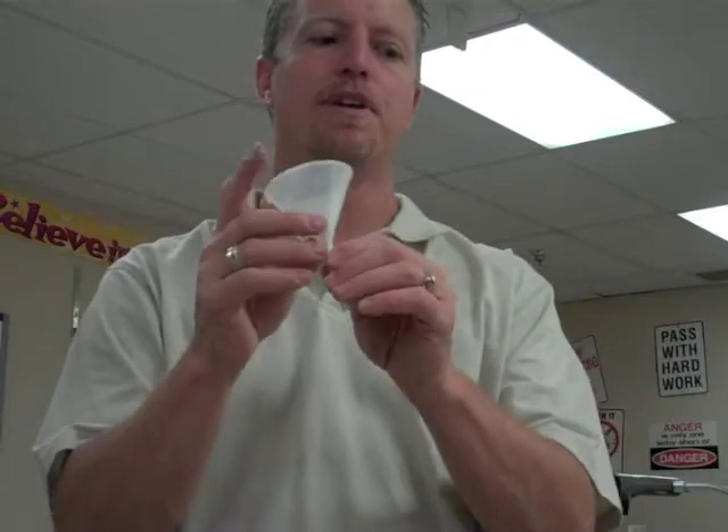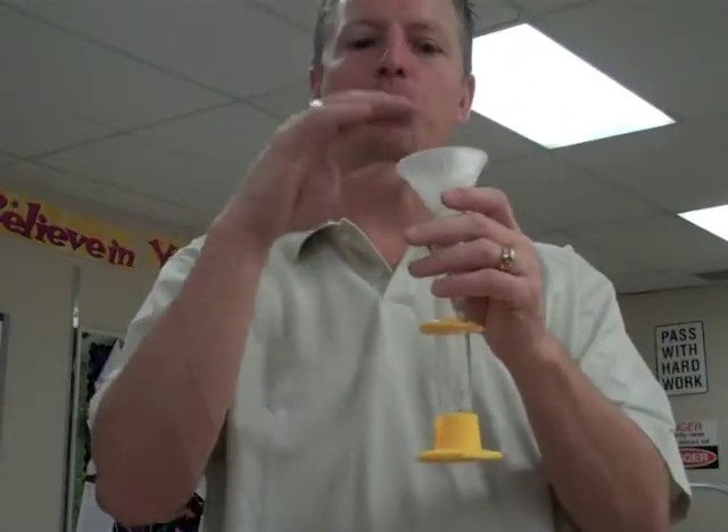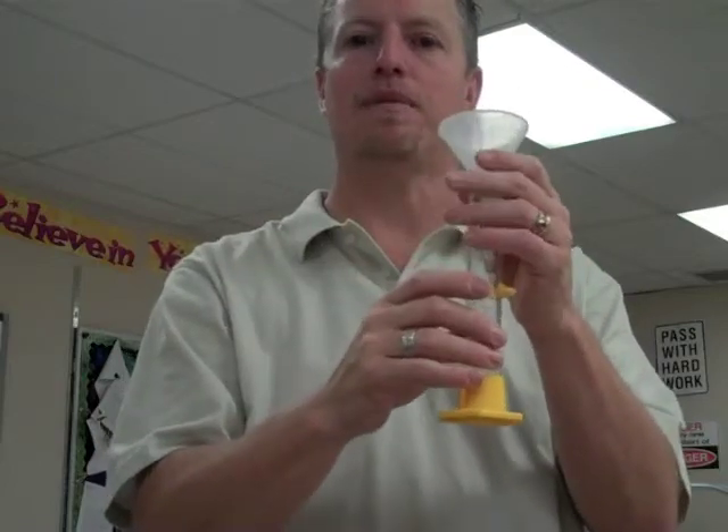This is a funnel. This helps us to pour liquids and sometimes fine powder into other bottles or containers, giving us a bigger opening so that when we pour it in there it doesn't make a mess.